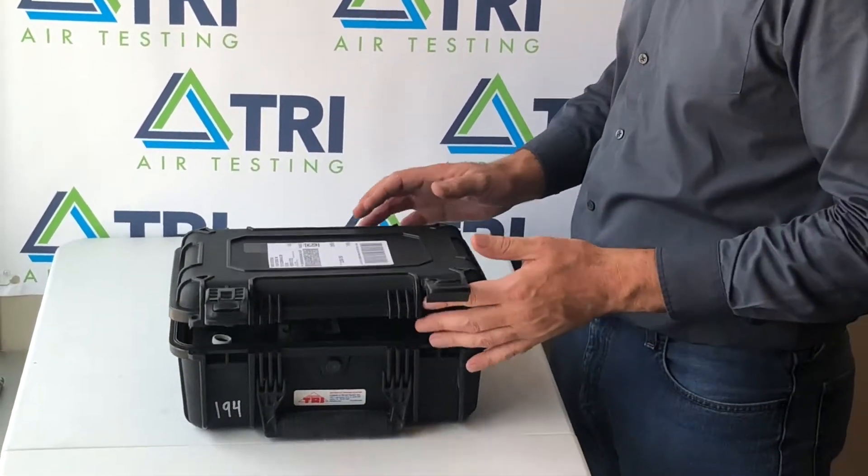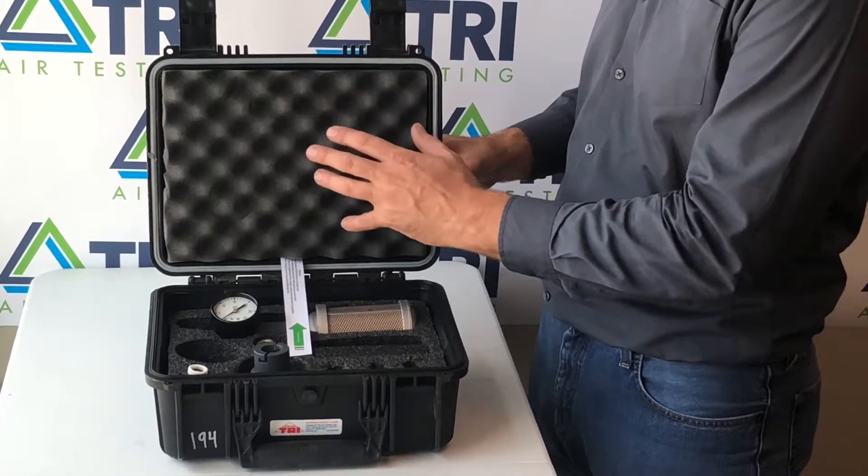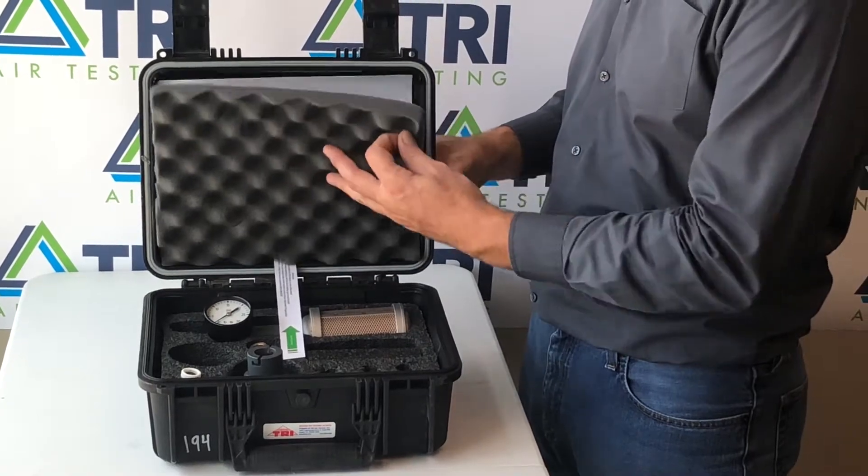When you receive your air test kit, open your kit. Your instructions, data sheets, and any pertinent information will be located behind the foam insert in the lid.